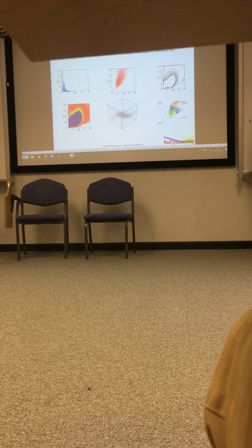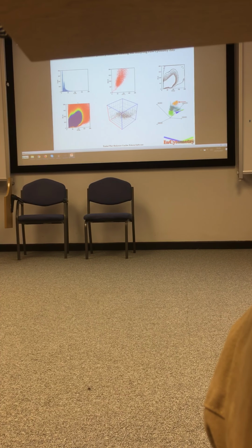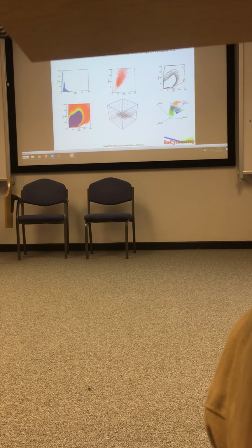The problem is, you're asking the scientists to analyse 12-dimensional data on one plot. It's a bit of a gimmick in a way. I can see where it might be useful in some circumstances, but I can't see anybody seriously using it for that. I know quite a few people who have Kaluza, and none of them use it, not in any serious way.